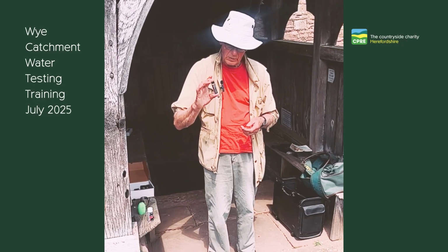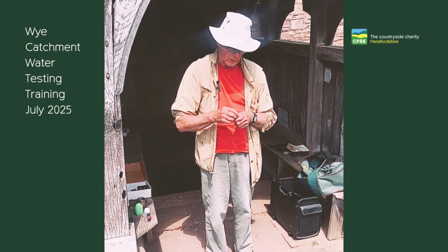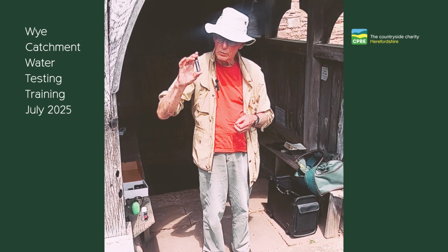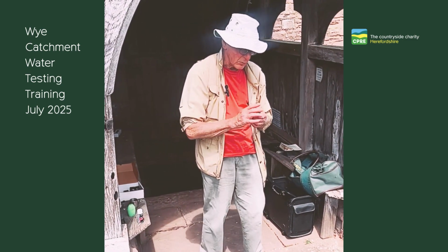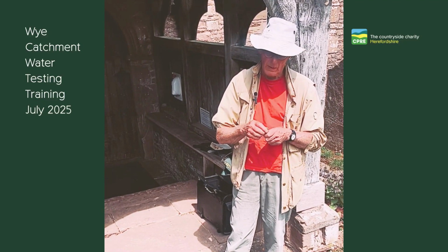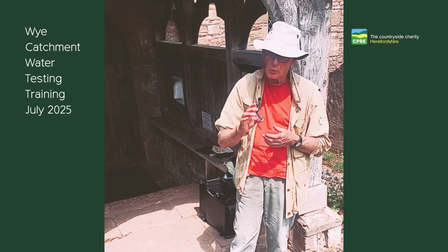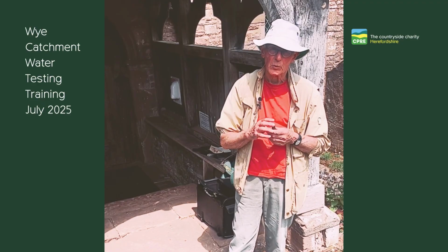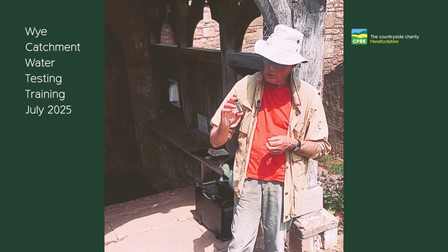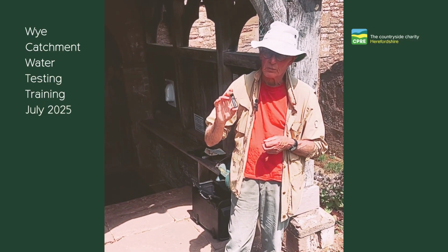This Welsh water sample has probably about 2 parts per million of phosphate in it, which is why it's turned quite bright blue. The likely readings that you'll get from the streams that you'll be sampling are much lower than that. And this raises an important point. You should never wash out your equipment in tap water. Otherwise, you'll be introducing into the cuvettes some water which has in it a very high concentration of phosphate.